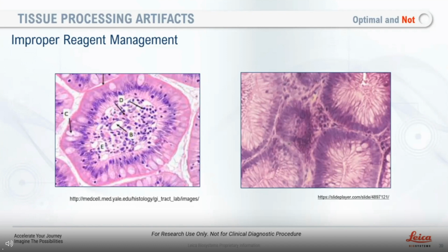I think we have to establish first whether the integrity of the paraffin has been maintained. You want to make sure that it doesn't get too hot. Sometimes with maintenance, people tend to delay the schedule of when they change it. You can get an oversaturation of paraffin, but it would have a really soft, greasy feel to it.